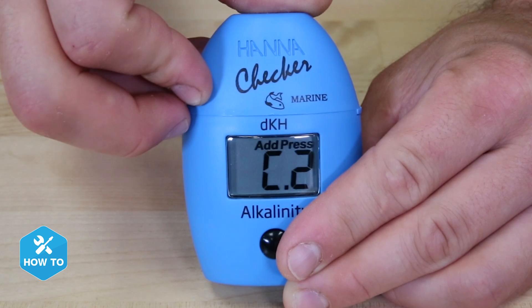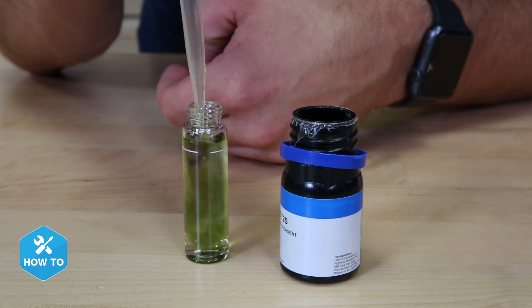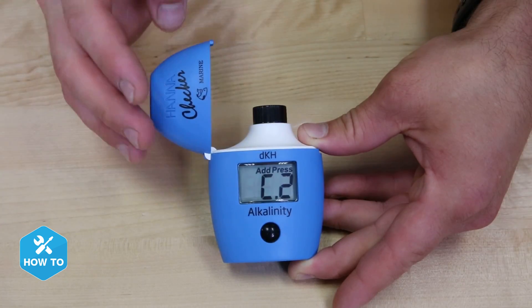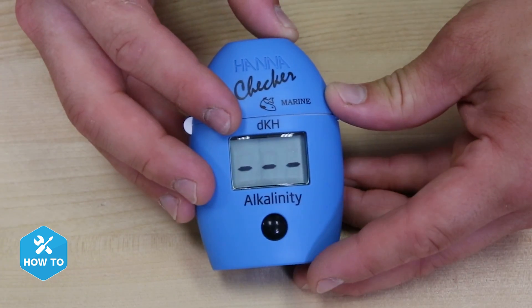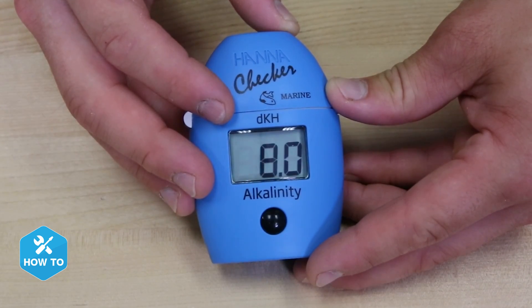After the checker reads C2, I can remove the cuvette, add one full milliliter of reagent, gently turn it upside down five times, and then put it back into the reader. One more push of the button will provide me with my tank's current DKH, and that's it — it only took me about 30 seconds.